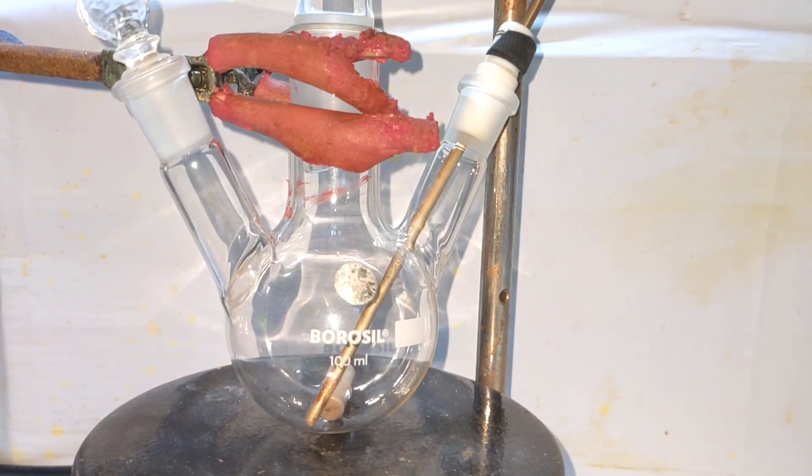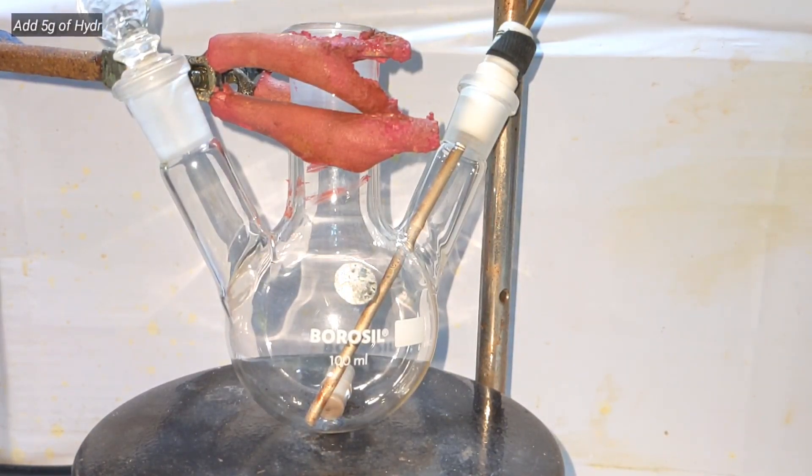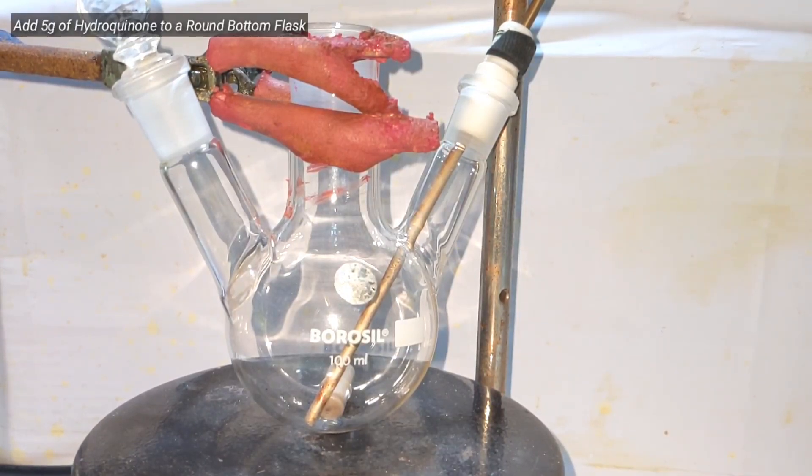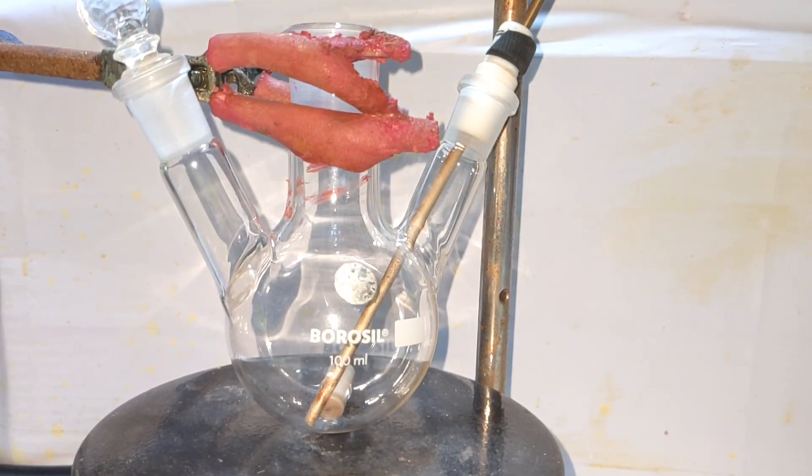Start by fixing a 100 milliliter three neck round bottom flask on a stand. One of the side necks is closed and the other side neck has a thermometer adapter with a temperature probe of the hot plate going inside.